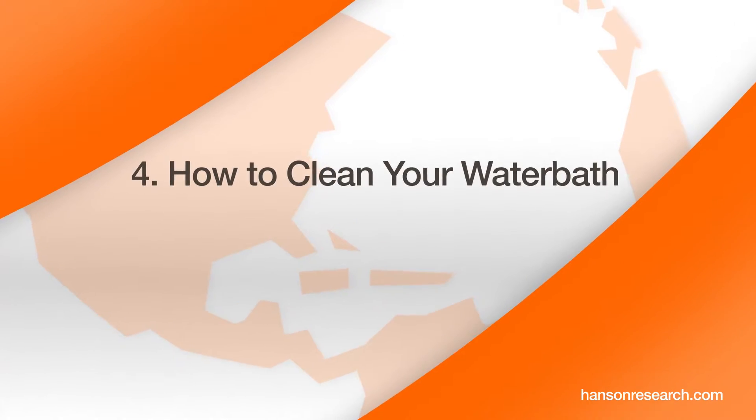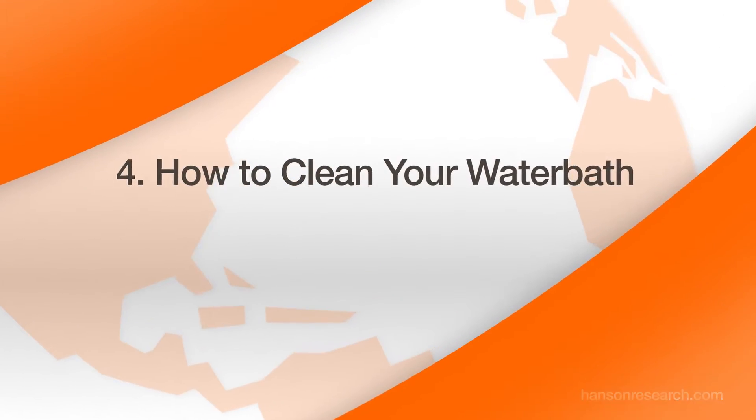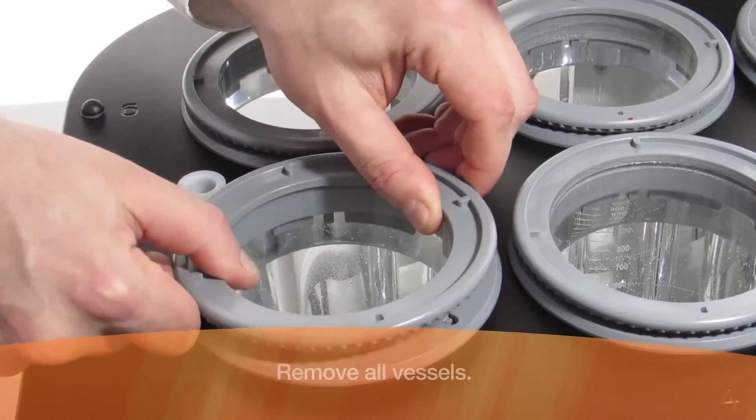How to clean your water bath. Remove all vessels.